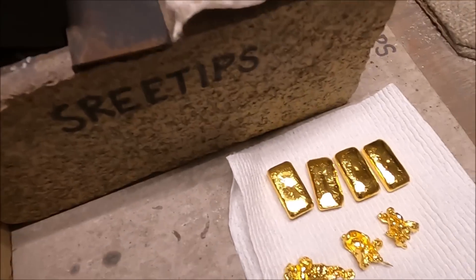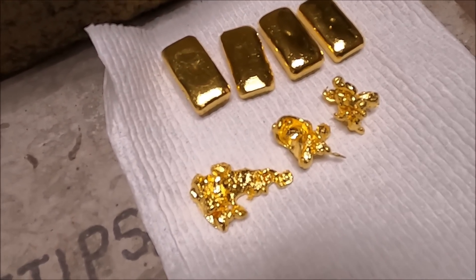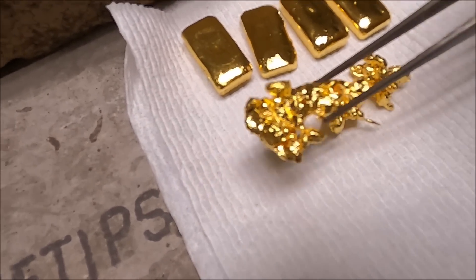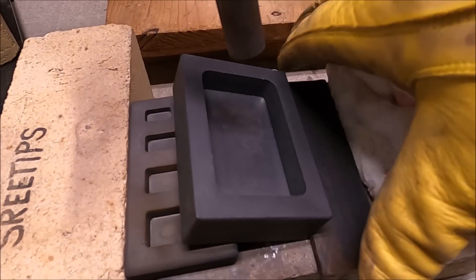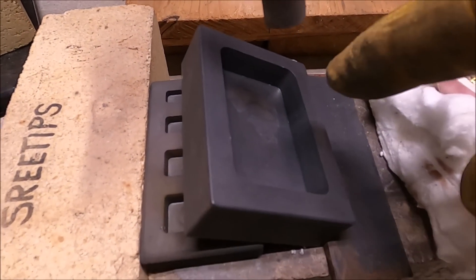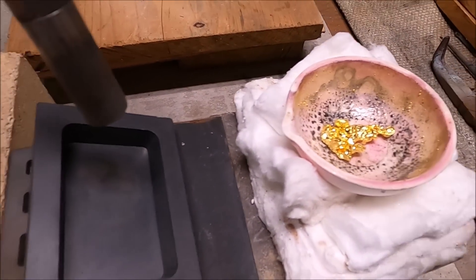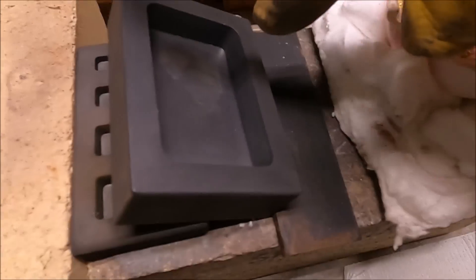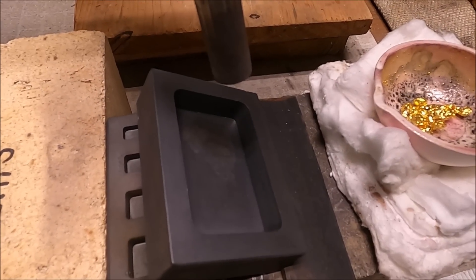I need to cast these four bars into an anode bar in this mold, but before I do that I need to create a stringer — some type of device that I can cast into the bar to hook it on the edge of the beaker. My plan is to take some of this pure gold, with the mold turned sideways and a piece of metal down here, heat it up real hot, and try to pour a long stringer piece. I'm going to put my mask on, start the torch, melt this gold, and try to make a long piece.